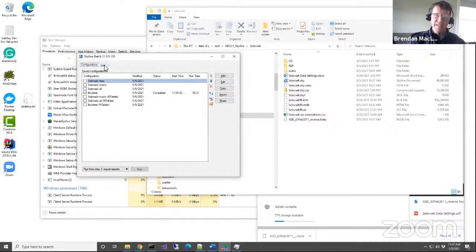But yeah, if you're going to do this kind of large scale processing, having a good amount of memory and faster processors. It seems to me pretty cheap to get a hex core i7 processor now, and that's what I would get for a desktop if I were buying one today.